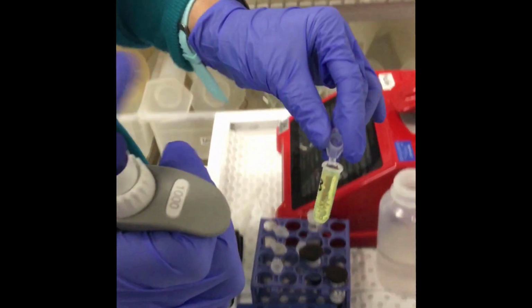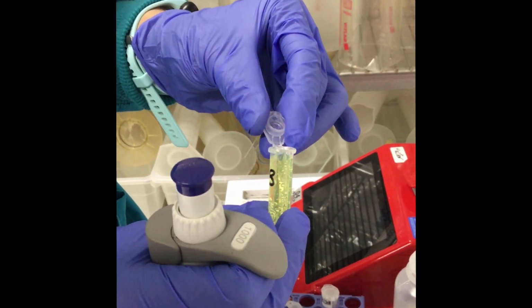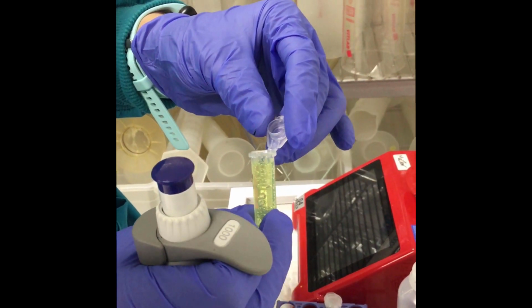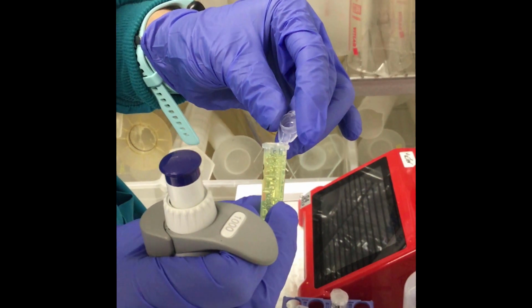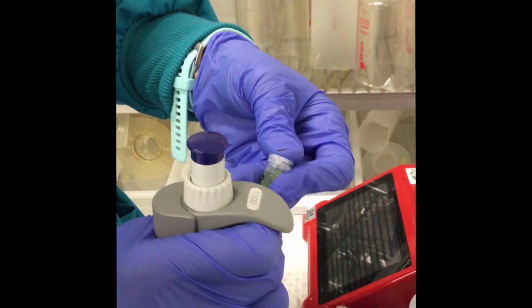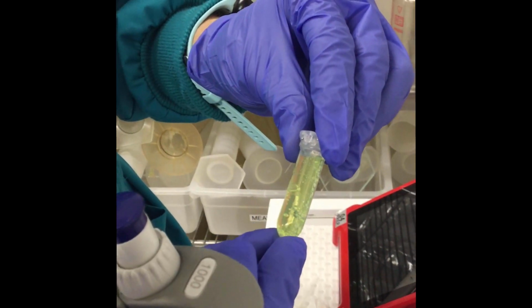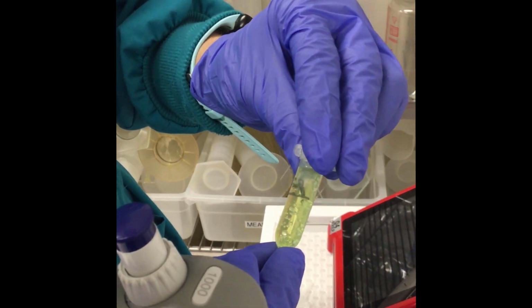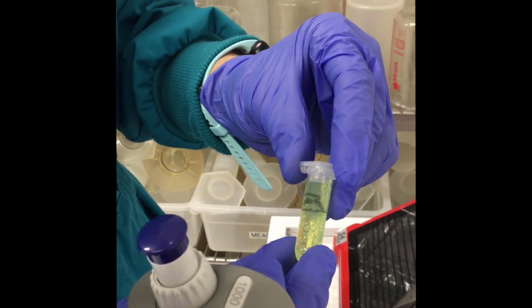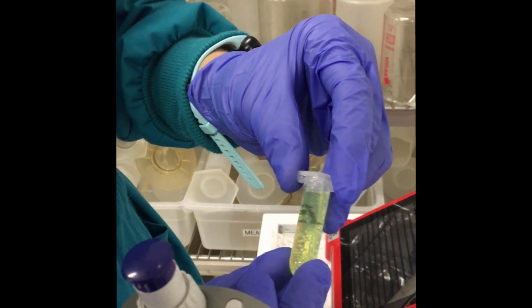You can see that our volume in there is close to the top. You should have 1.9 milliliters in each of your tubes, and you can tell that just by looking at how full your tubes are. There's not much room for any extra liquid in there. So make sure with each one you check your volume to ensure that you have done everything correctly.